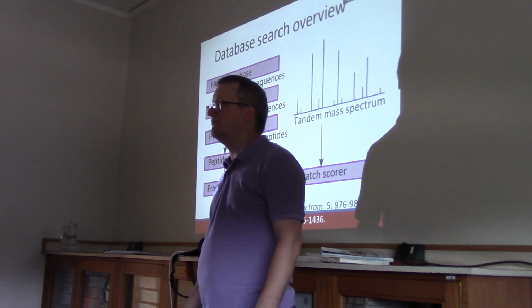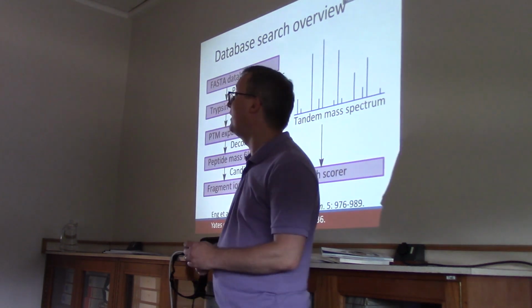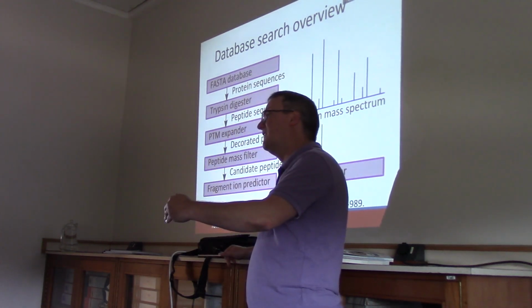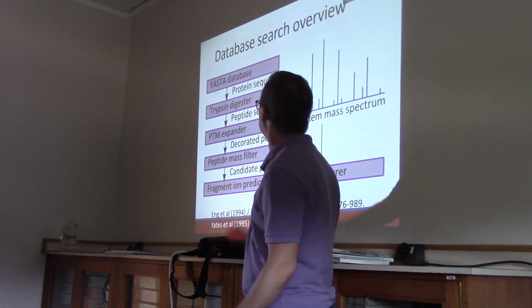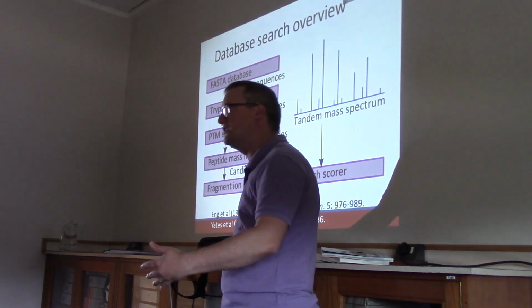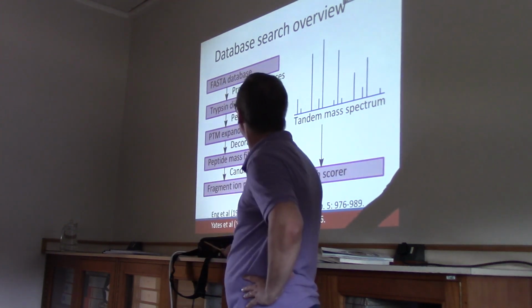So, yeah, I don't mean to single out people with dandruff. I am known myself, but in any case, we end up with some proteins there that we didn't think were in our samples. We add those as contaminants along with all the different proteins that are possible for the origin of our sample.